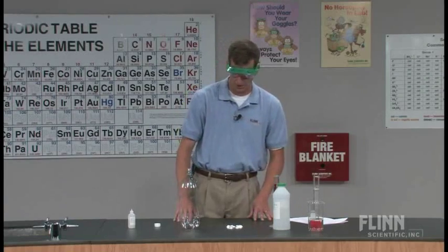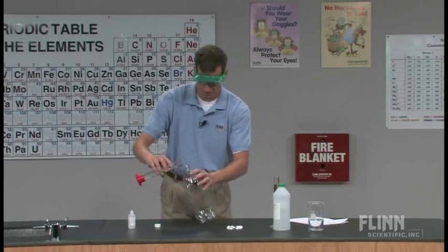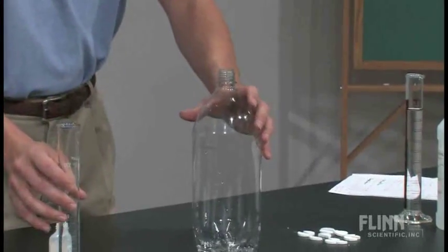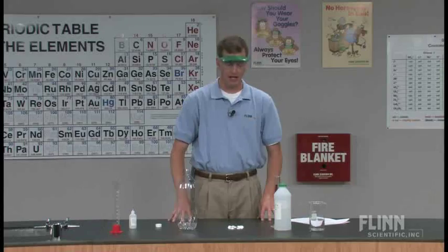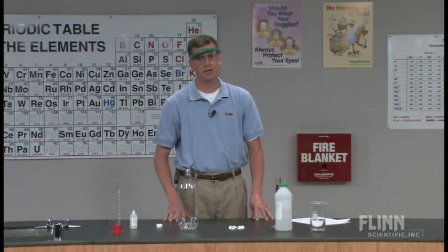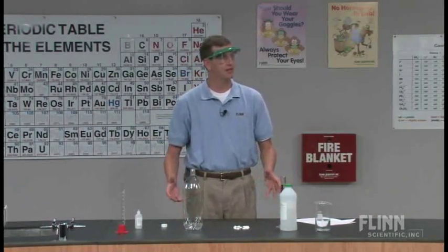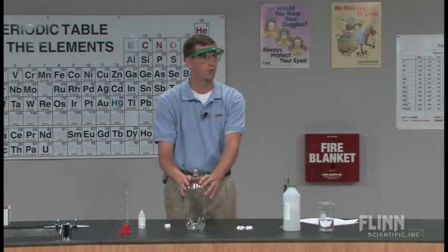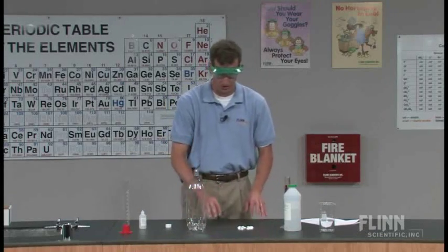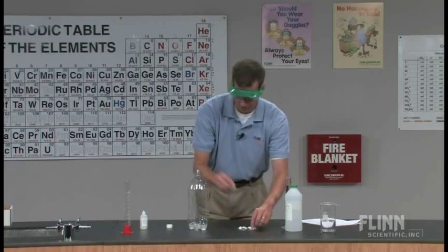The reaction will take place spontaneously. In order to show that reaction, we're going to take 100 milliliters of distilled water and generate some carbon dioxide gas by dropping Alka-Seltzer tablets into the water. This is one alternative to generating carbon dioxide gas. Some of you in your laboratories may have access to a carbon dioxide tank — if that is the case, you can just run a hose into it and flush the bottle with carbon dioxide, and you don't have to generate it with the Alka-Seltzer.